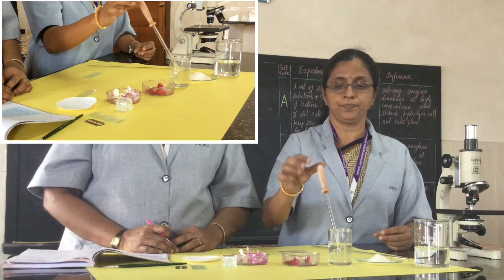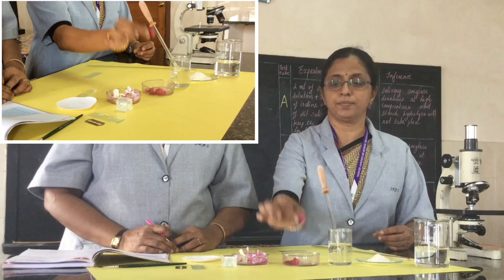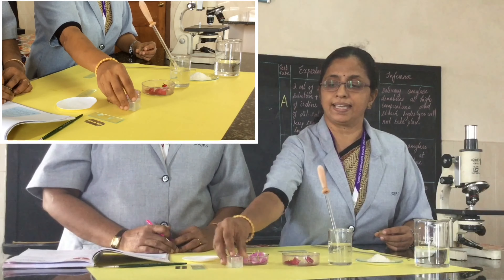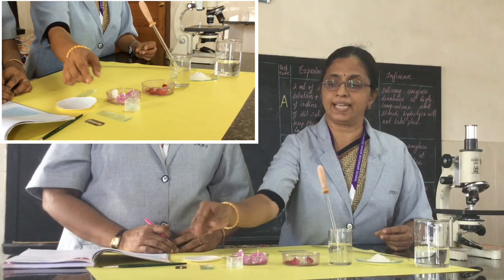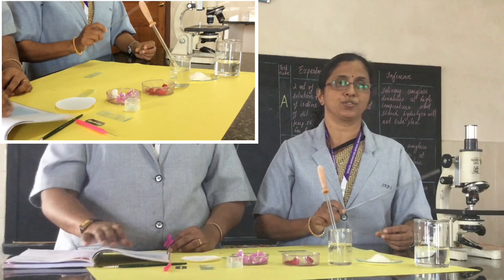Next we need a dropper. Then we use two flowers — one balsam and the other one Vinca rosa. We also need a cover slip, cavity slide, blade, brush, filter paper, and microscope.